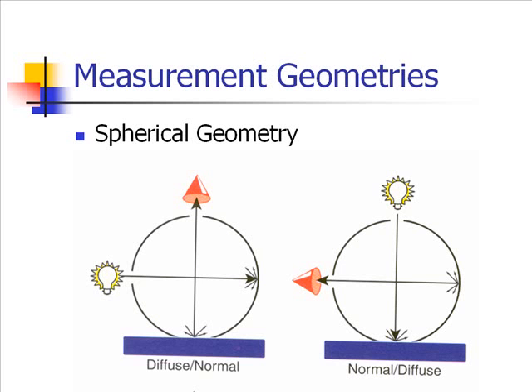The light shines in, hits the sample, and then light bounces off in many different directions, and the detector catches the light no matter what direction it came off on. Because the sphere is white, the light bounces around until it finally hits the detector. It's not only at one specific angle of viewing. Our first kind of geometry, the 45-0, measures what we call appearance, so how it actually looks to our eyes. So it reproduces the best how we actually see a particular sample.